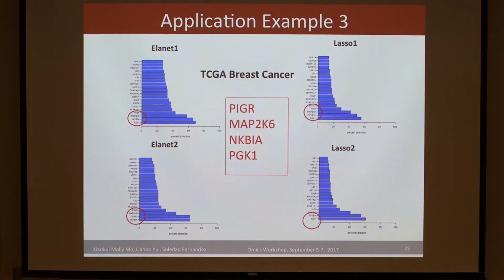So now let's talk about something related to what we had in our workshop. As you remember, Dr. Yu used 4 different methods trying to find top genes which can predict overall survival. And as you see, 4 top molecules are common among those 4 methods. But we don't know how they are connected. Now you can use IPA or you can do a PubMed search.